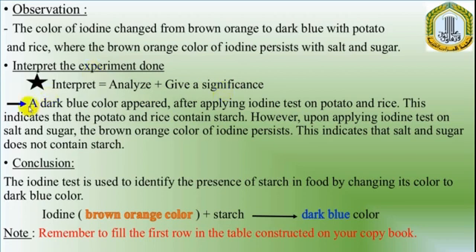Our analysis says that a dark blue color appeared after applying the iodine test on potato and rice. Stating the significance, this indicates that potato and rice contain starch.